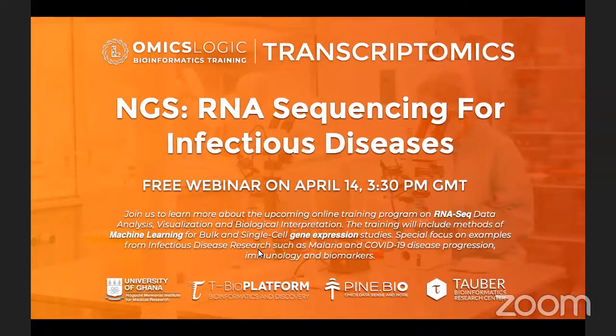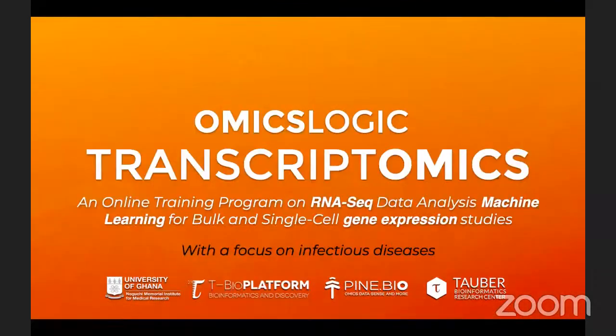Today's session will introduce you to the RNA-seq data analysis and the upcoming online training program. This training will include methods of machine learning for bulk and single-cell gene expression studies, with special focus on examples from infectious disease research, such as malaria and COVID-19 disease progression, immunology, and biomarkers.